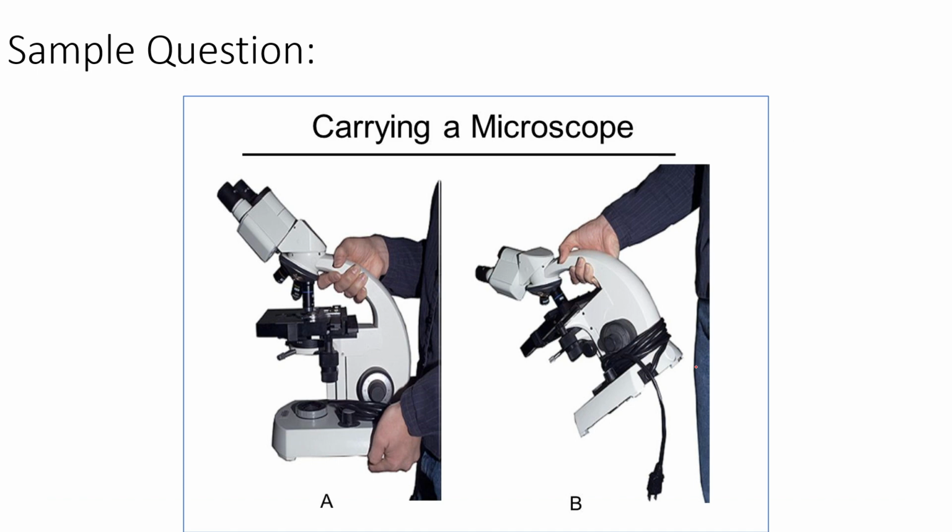So in this picture here, which one is correct? That would either be figure A is correct or figure B is correct. So you should pick A. Now on your test, there's going to be more than just 2 pictures to choose from, but this just gives you an idea how that question is going to look on your test.